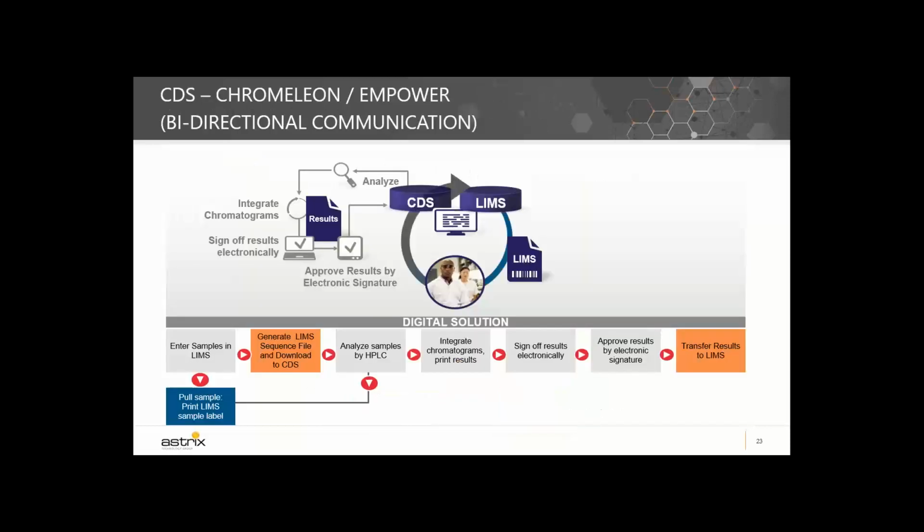So let's go to a different topic here. This topic is really about the module to integrate with chromatography data systems. And our focus here is really on the leading products on the market, which are Chromeleon from Thermofisher and Empower from Waters. SampleManager has interfaces to communicate with these two different CDS systems.